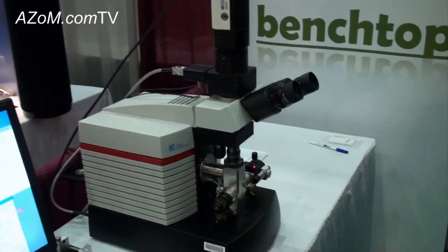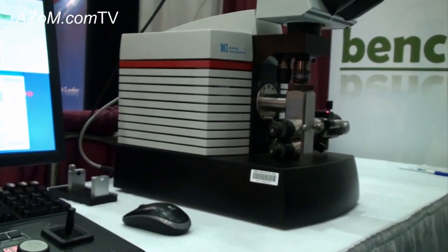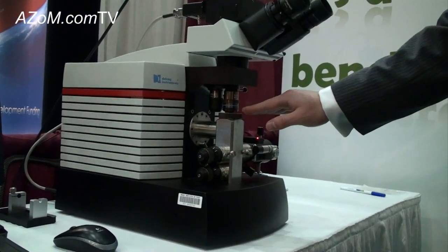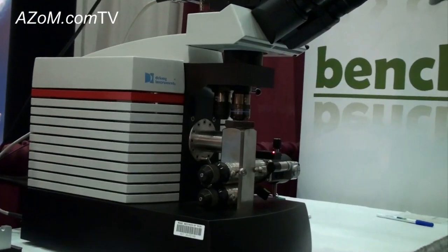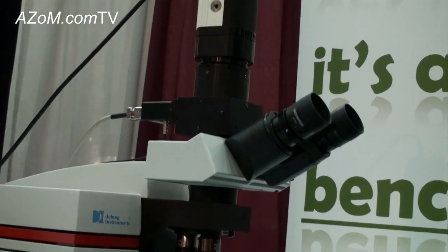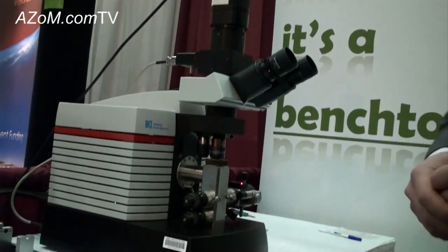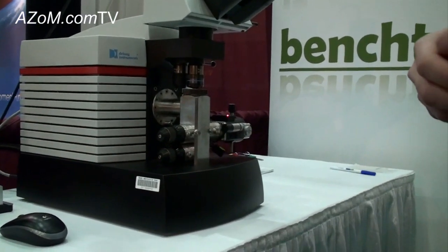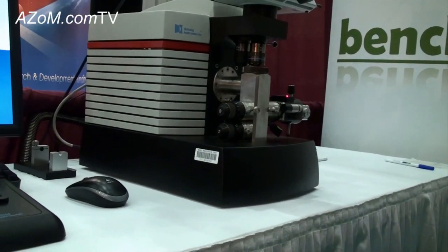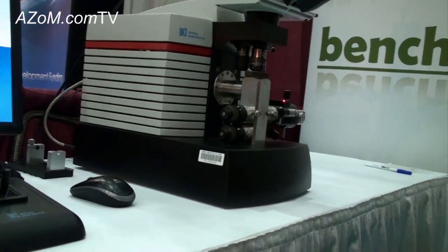In terms of resolution, it's capable of 2nm resolution in TEM mode and 3nm resolution in SEM mode. The entire electron microscope is essentially this portion here. We have our phosphorous screen at the top of the column, and essentially an optical microscope going up to our CCD detector for TEM acquisition. We have a photomultiplier for STEM and two backscatter electron detectors in the column for SEM detection.